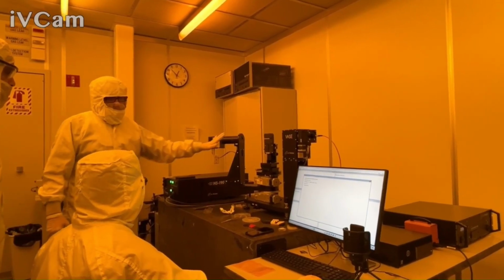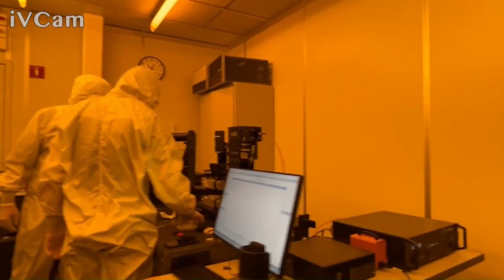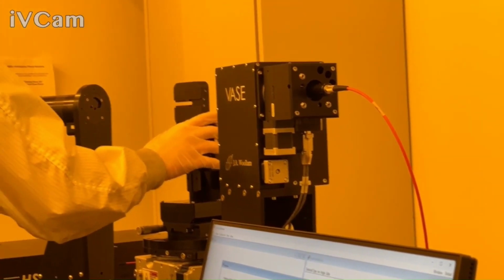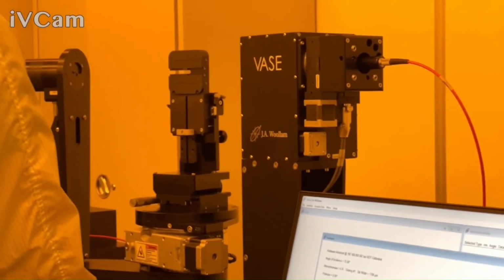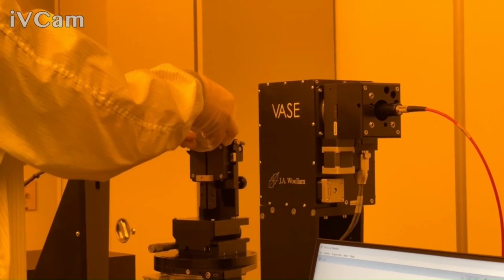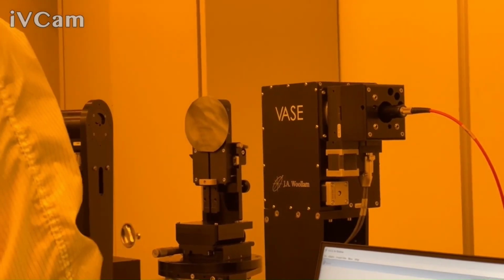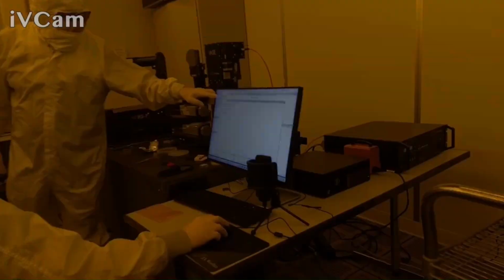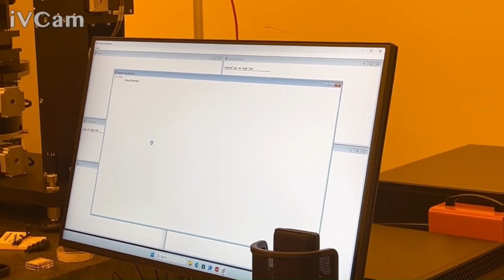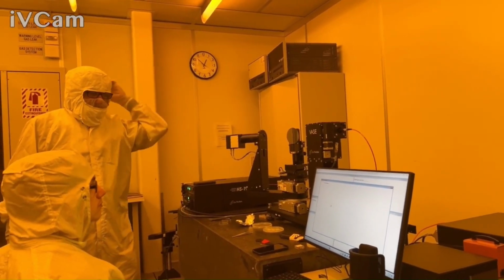So we'll go ahead and load this way for now. Essentially, the slider you can use whether you want it or not. That's just made for shipping. You can also use the small one. It's not that big of a deal. It's just mainly you definitely need the small one for the smaller samples. Data, calibrate system, and just the standard settings are fine. Do a fine calibration. So it's going to start prepping stuff, the monochromator to a certain wavelength. It should ask you to put the alignment detector in shortly.